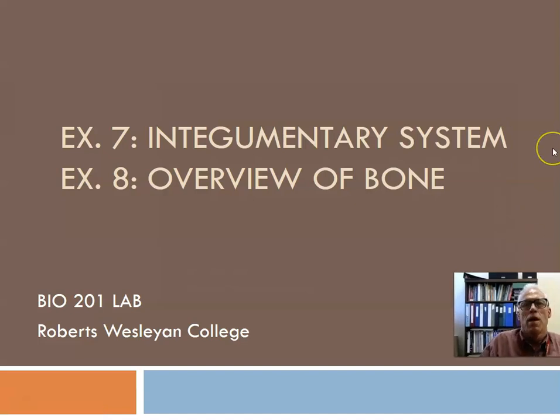This narration will guide you through exercise 7 of our Anatomy and Physiology Laboratory Manual on the integumentary system of the skin. The next recording will cover bone tissue, a little bit about bone tissue. So this will allow you to see what I want you to know about skin, and it's particularly the histology of skin as a way of reinforcing some of the skin structures and functions.